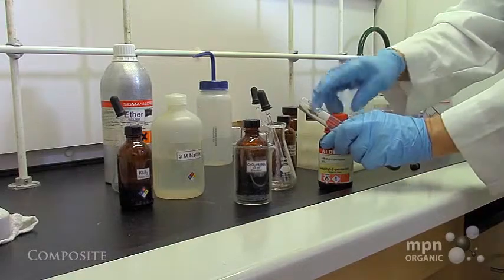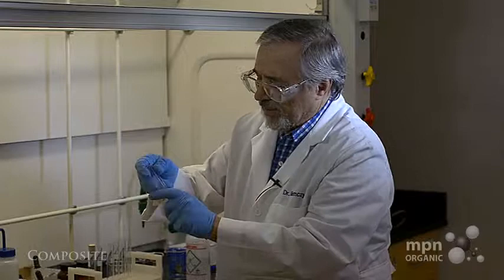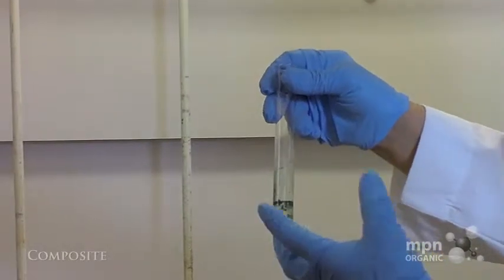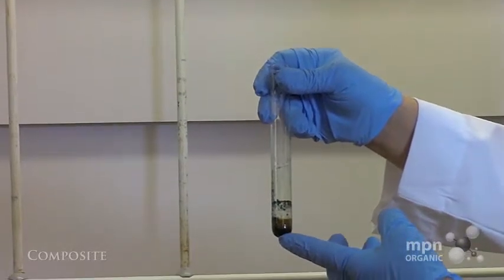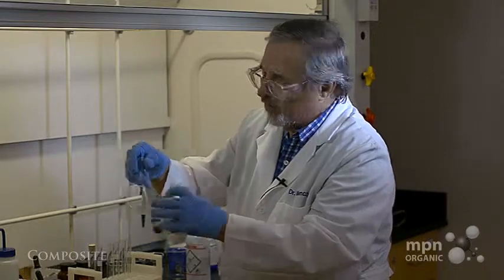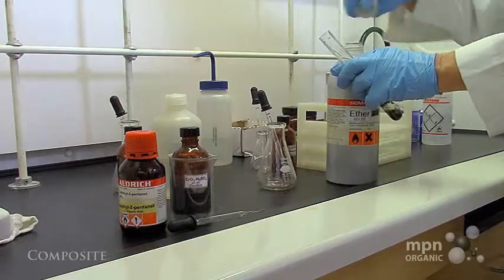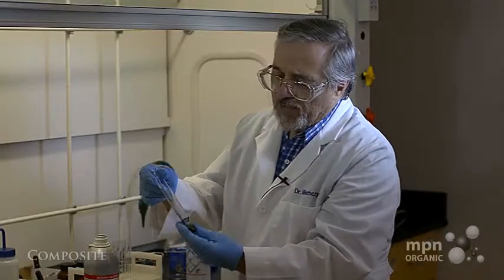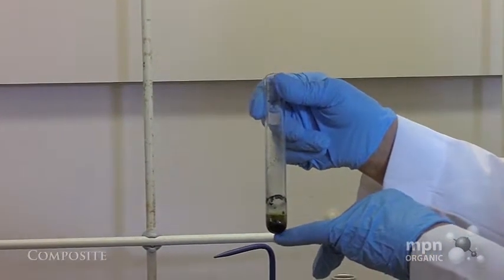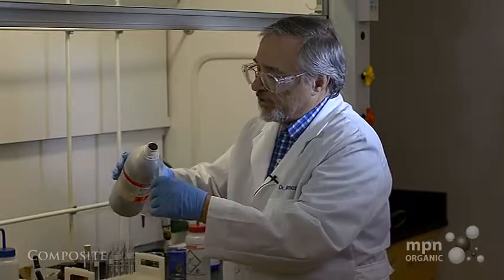So let's, okay, we don't need this anymore. Let's get rid of that. Okay, now what we're going to do is put some diethyl ether into this, and we're going to extract out the compound that we said we formed, namely the 4-methyl-2-pentanone from the oxidation with chromic acid. So let's get our diethyl ether out here. Now, with this diethyl ether, I'm also going to extract out a little bit of water, so there will be water in this, and I'm also going to extract out some of the acetone as well. So that's just the way things are.